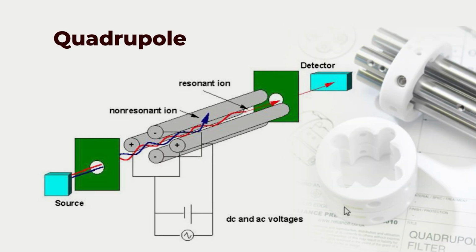You have the source, you have high charge. Remember, the ions are created under a very, very high vacuum. So the mass spectrometer is all operated under a high vacuum. In the case of separation in HPLC, for example, you require high pressure for separating it. But when it goes to the mass spectrometer, then it is high vacuum.